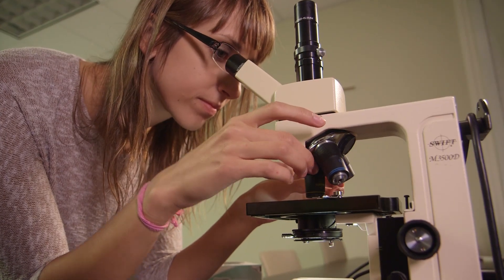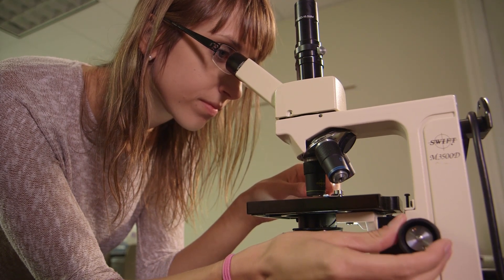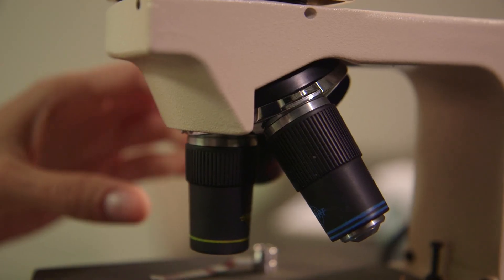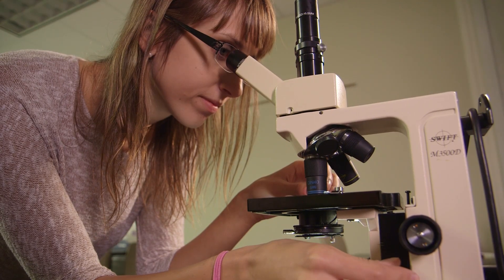Once you have located a live organism, try to center it and then switch to low power. If the organism is small enough, you may also wish to switch to high power after focusing under low power. Remember, the specimen must be clearly focused under low power before you switch to high power because the microscope is parfocal. Otherwise, the high power objective may be damaged as it comes into contact with the slide. Now sharpen the image with the fine adjustment.